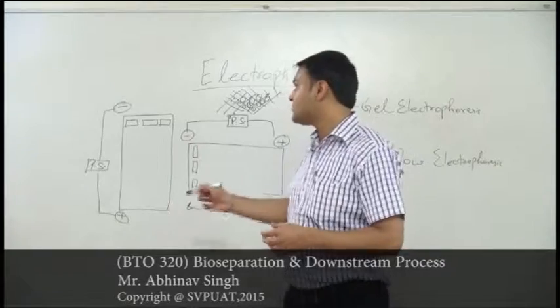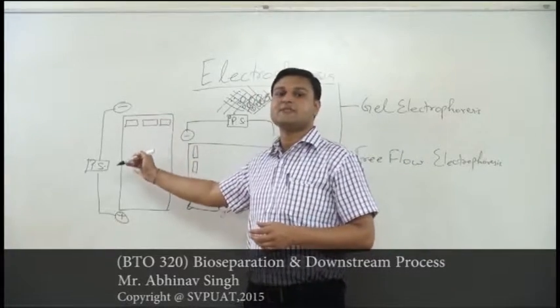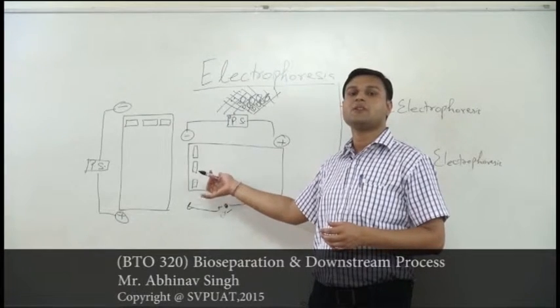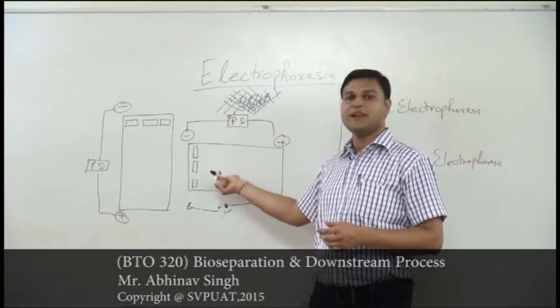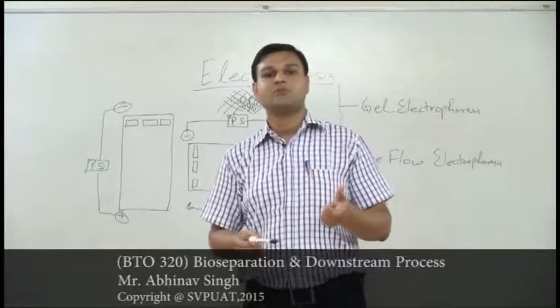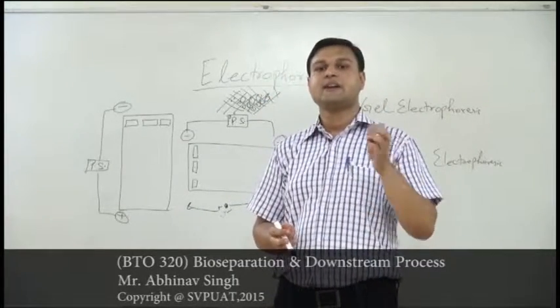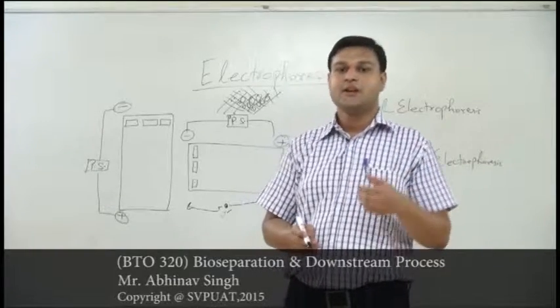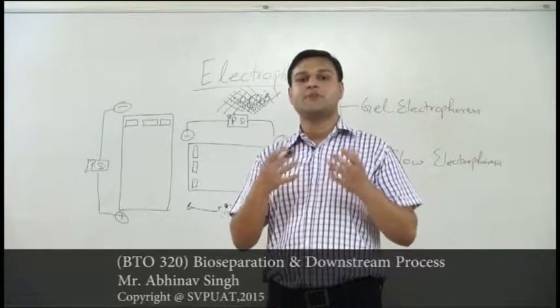In this kind of system, as we know, polyacrylamide gel is specific for proteins, whereas agarose is important for electrophoresis of nucleic acids. For polyacrylamide gel electrophoresis, if we treat them with sodium dodecyl sulfate, how is it treated? We directly add sodium dodecyl sulfate in the required amount and we boil the protein sample. Due to this boiling, the protein will first of all uncoil.